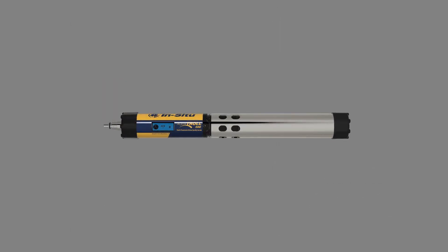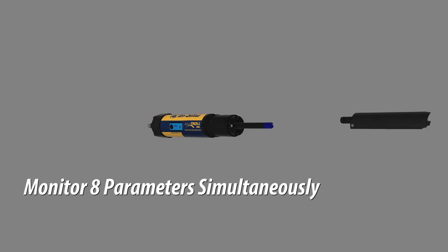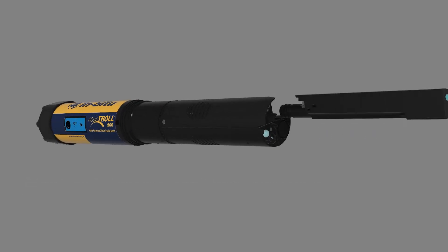Monitor up to eight parameters simultaneously. Available sensors include pH, ORP, conductivity, temperature, dissolved oxygen, ammonium, chloride, nitrate, and more.